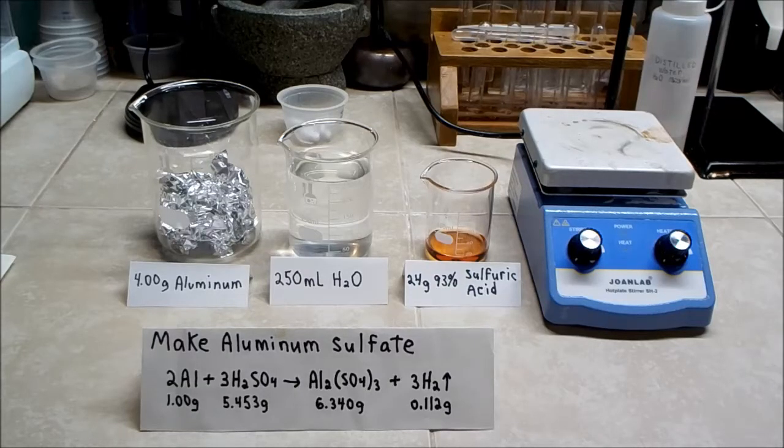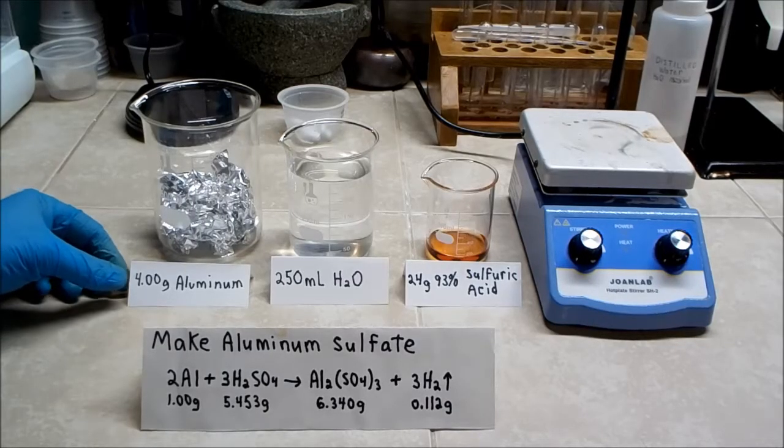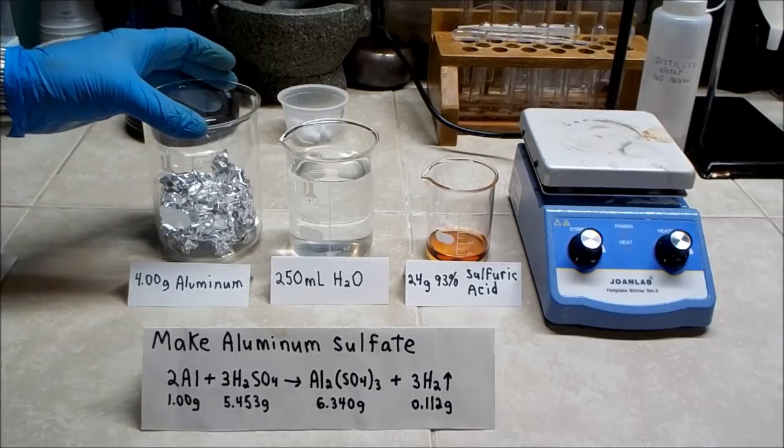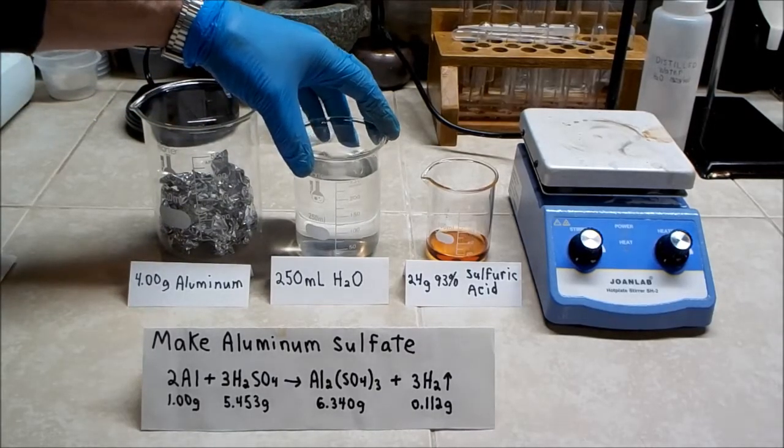The formula for the reaction is shown here and has been normalized to 1 gram of aluminum. That will yield about 6.34 grams of aluminum sulfate. I want to make about 25 grams, so I multiply everything by 4. Here are the ingredients you will need.